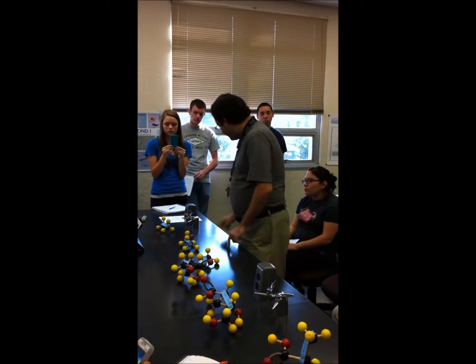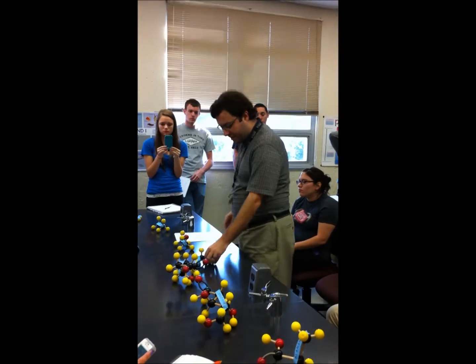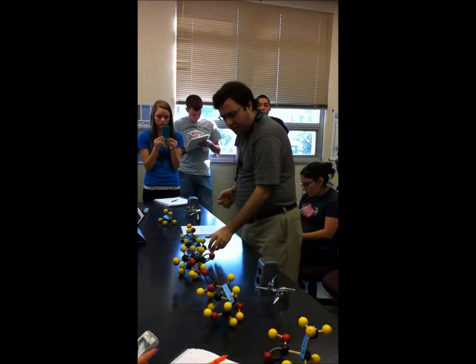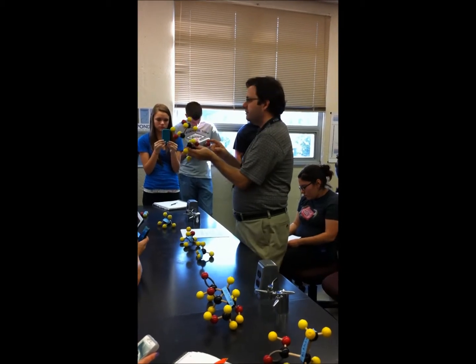All right. Let's see, molecular models. Do be able to tell me, like with the sticks here, those are single covalent bonds. The springs represent double covalent bonds. Okay?